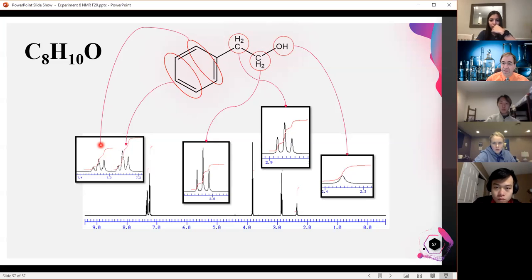As you practice this, if you see a molecule now, you should look at the molecule, introduce yourself, and then try to think about what its NMR probably would look like. You can predict NMR spectra in Spartan. Now, Spartan will not give you as much of the splitting. Well, it gives you the splitting, but it does it theoretically, so sometimes it's a little bit off.